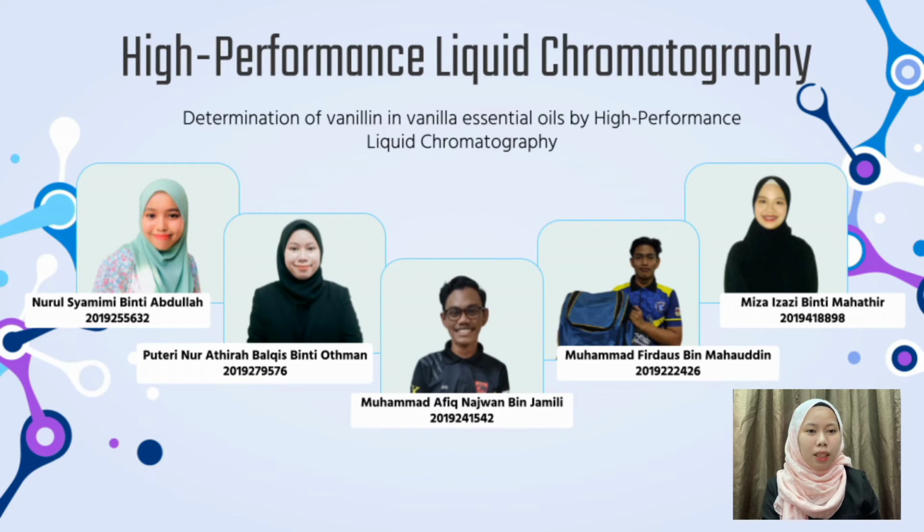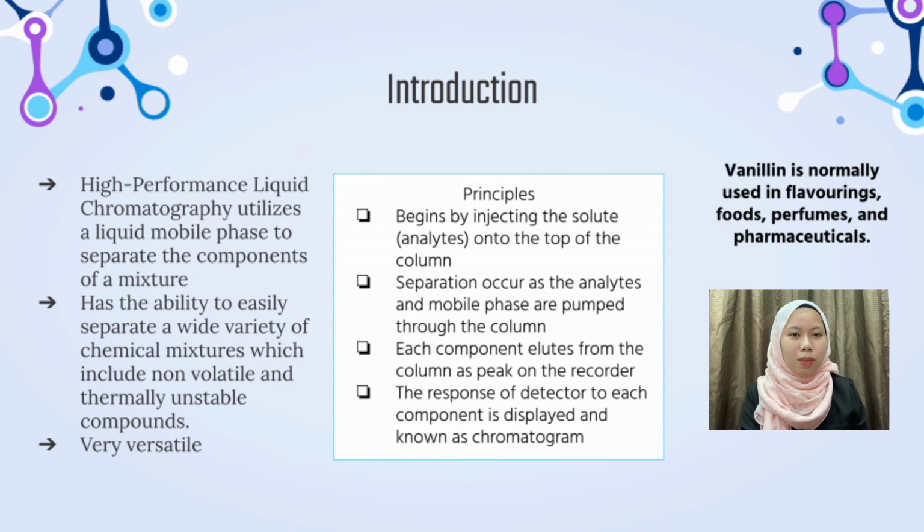Determination of vanillin in vanilla essential oils by high-performance liquid chromatography. I will explain about high-performance liquid chromatography. HPLC, or high-performance liquid chromatography, utilizes a liquid mobile phase to separate the components of a mixture. High-performance liquid chromatography is very versatile because of its ability to easily separate a wide variety of chemical mixtures, which include non-volatile and thermally unstable compounds like organic, inorganic, and biological samples.